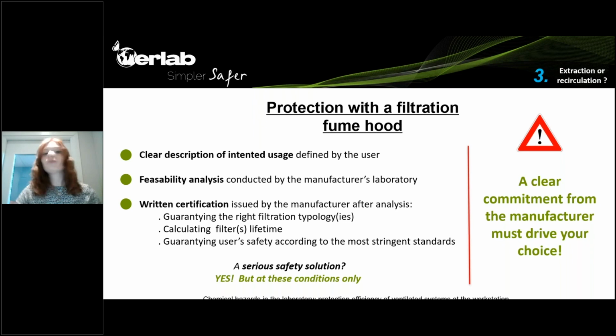So first of all, a clear description of the intended usage defined by the user. This is crucial: a description of what is going to be done under the fume hood, and the type of handling and chemicals, defined by the user himself, who describes it to the manufacturer.